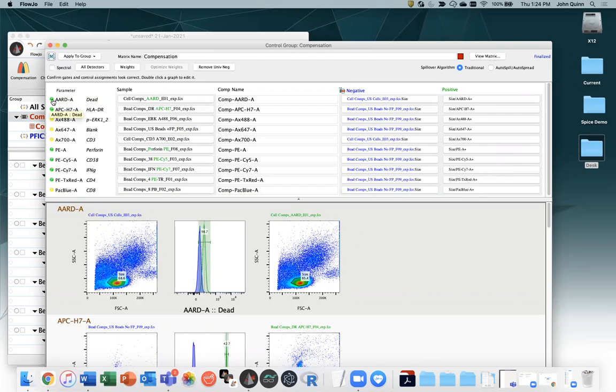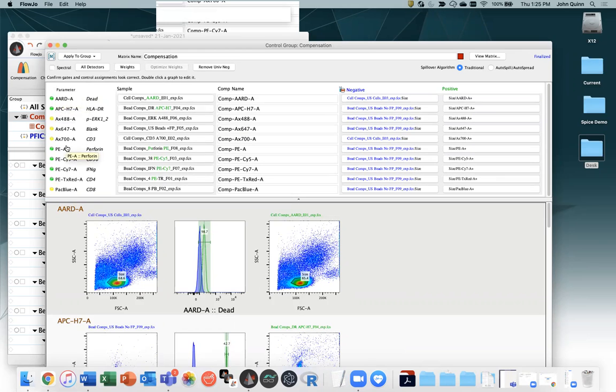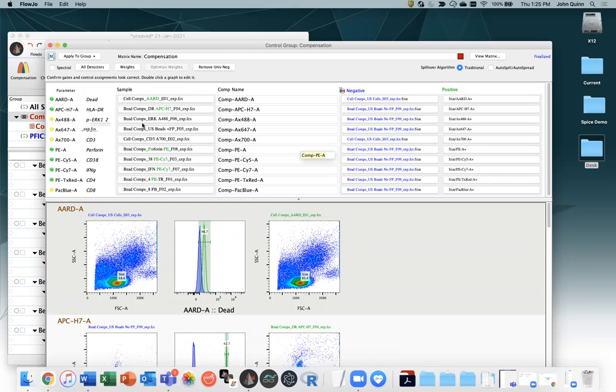You'll notice that you've got colored markers next to each item in this list that range from green here to yellow, but red would be a possibility also. You get green if we have, let's skip past the live dead marker. That one will be an exception that we'll come back to.